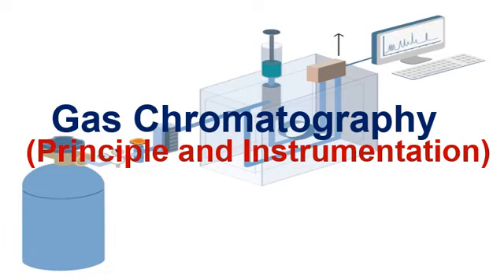Basically, this technique separates different types of compounds on the basis of factors like the boiling point of the compound, the atomic weight of the compounds, etc. On the basis of that, this technique separates different types of molecules in multi-compound systems, and we can identify the composition or the presence of different components in the compounds. The instrument used in gas chromatography is known as a gas chromatograph.